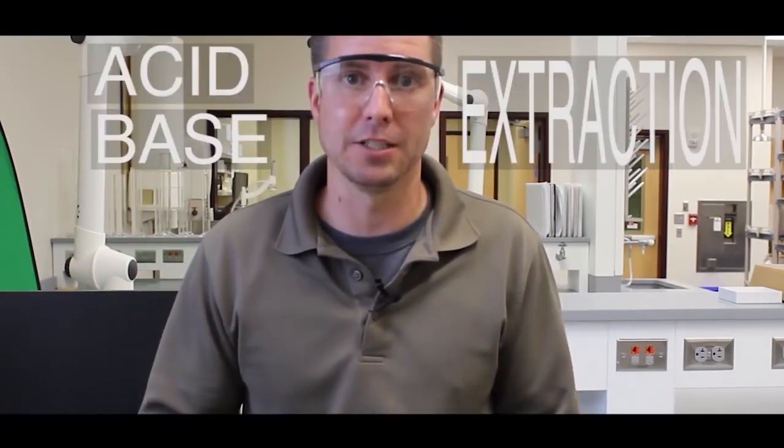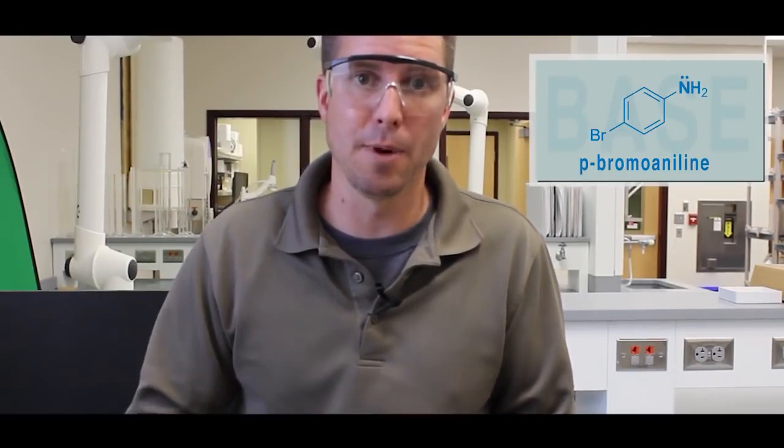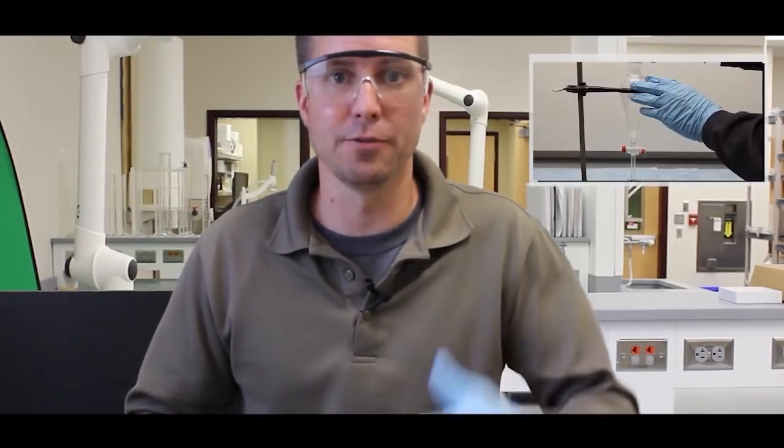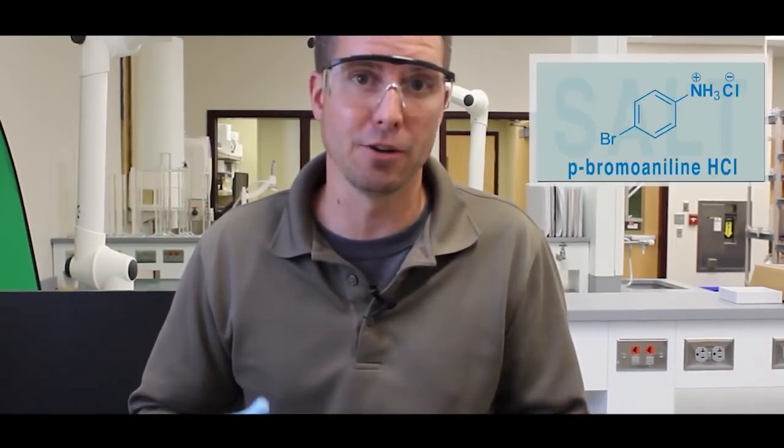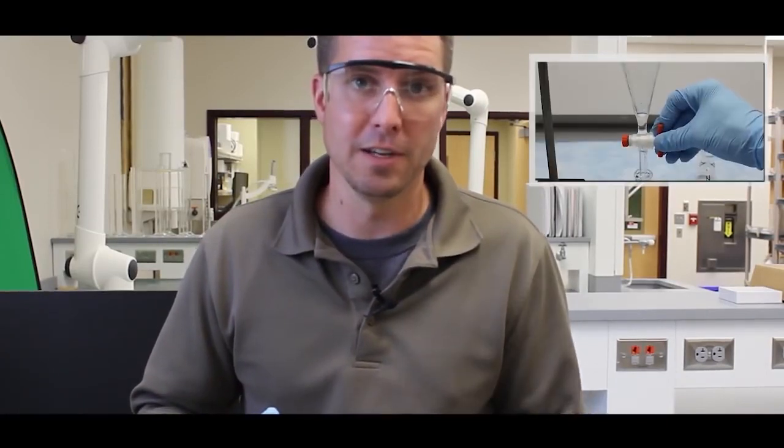So I'm going to separate a mixture that contains an organic acid, an organic base, and a neutral compound using acid-base extraction. Specifically, I will dissolve a mixture that contains benzoic acid, p-bromoaniline, and phenanthrene in dichloromethane, and then throw it into a separatory funnel. And then I'll add a solution of hydrochloric acid, which will convert the p-bromoaniline into its hydrochloride salt, which can then be removed in the aqueous layer.